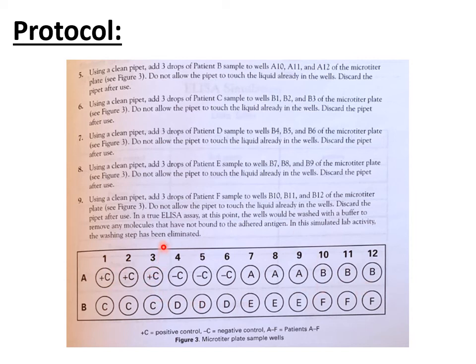So what I usually like to do is I draw a line around the 3 repeats, which I will also be asking you about in your results, why it's so important that you'll notice for each of the samples there are 3 wells. So every sample is repeated 3 times. And think about the purpose of this test and why it's so important to have repeats, especially since you are then going to have to tell someone whether or not they have HIV.